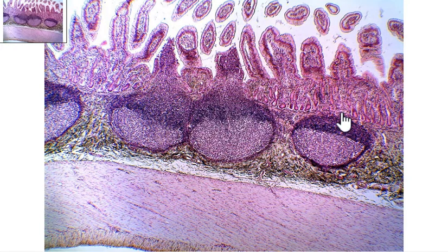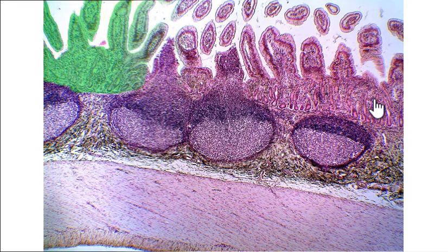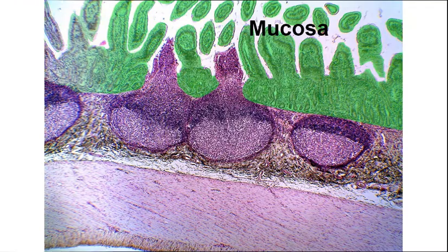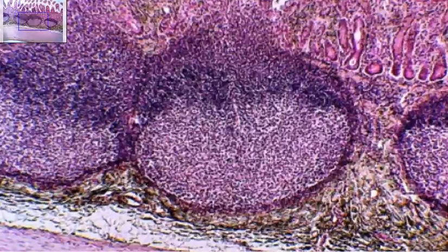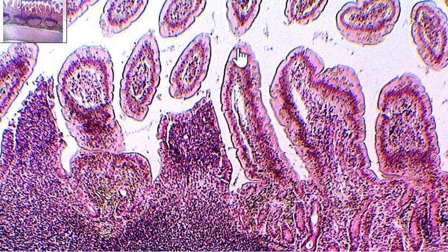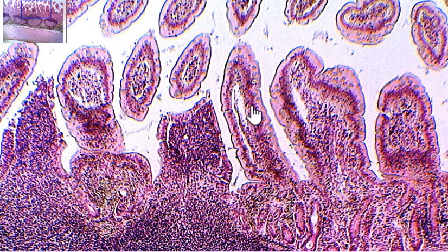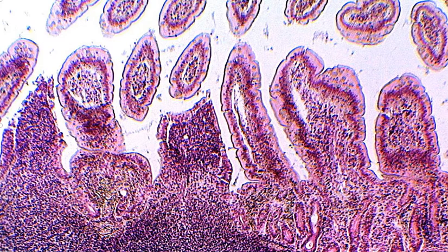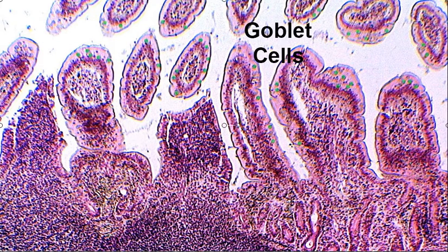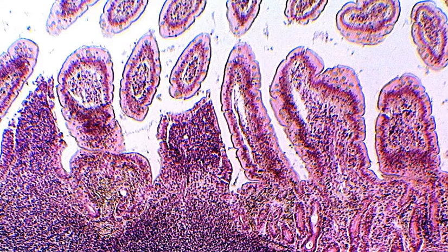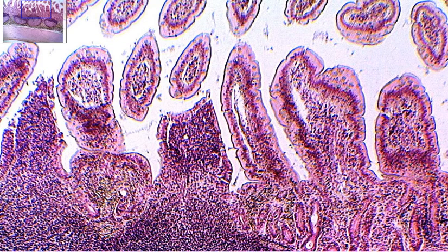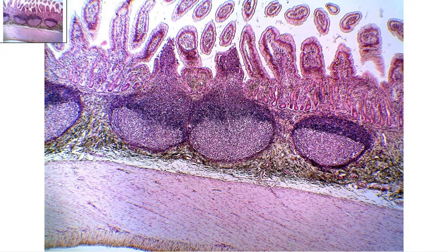Then up here, this is the mucosa. If you zoom in a little bit, you can see it is lined with simple columnar epithelium. You can see all these little tiny circles — those are goblet cells scattered throughout, so we have plenty of mucous secretion inside the ileum. This slide is the ileum, the distal portion of your small intestines.